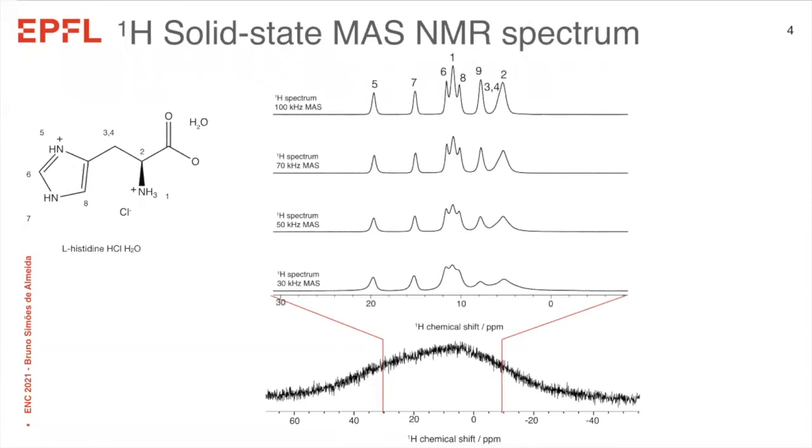in solid-state NMR by averaging out the homonuclear dipolar interaction in first order, and faster MAS rates will produce narrower line widths. However, these line widths are still 2 orders of magnitude larger than in the liquid case.